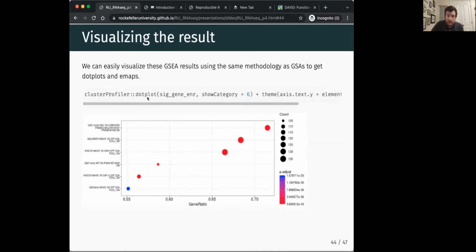And so we can still do dot plot on it. And so here you can see what terms we're getting out. We get a lymphoid progenitor cell, something about T cells, another T cell set, another T cell set, another T cell set. And you can see they're actually quite different from each other. And normally the first name within an MSigDB object corresponds to the study.